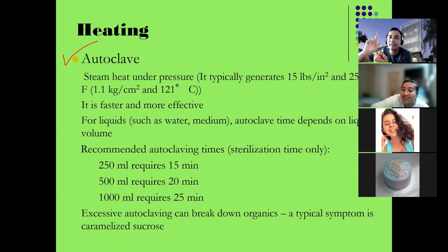Do you see this? I'm putting my finger, nothing is happening. But if I have the steam here, a steam spray, do you think I can put it like this? No, because the penetration power of the vapor particle is extremely energetic.